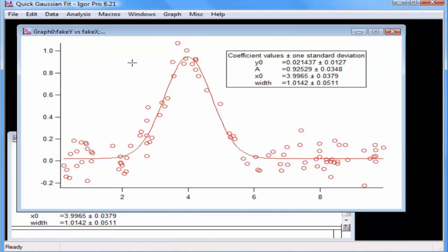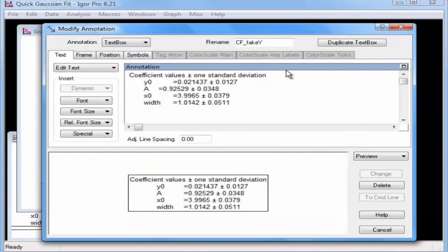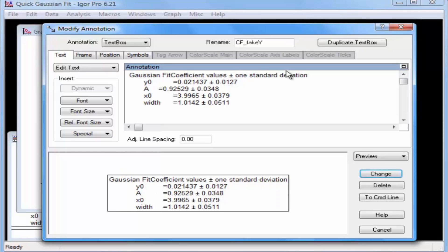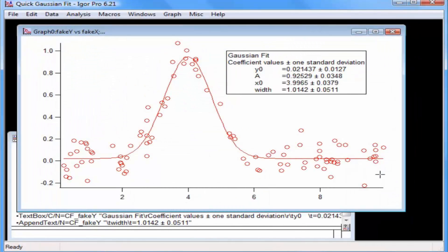Once the text box has been made and added to the graph, it remains as a standard text box. Double-click on the text box. This opens the Modify Annotation dialog. In the dialog, you can edit the text or add additional text. Type 'Gaussian fit' in the annotation portion of the dialog, then click Change. The text box now displays the title for the fit.